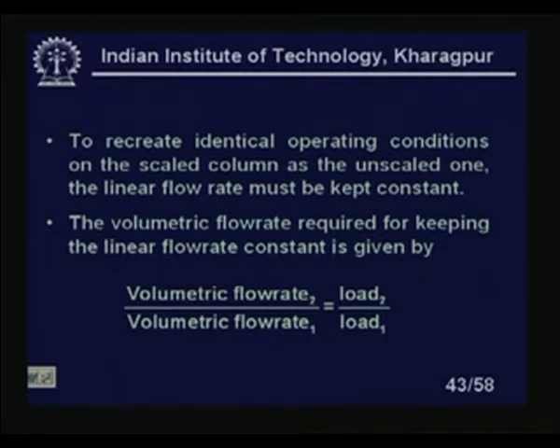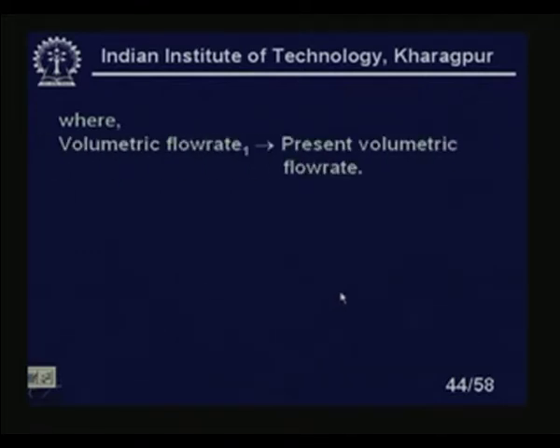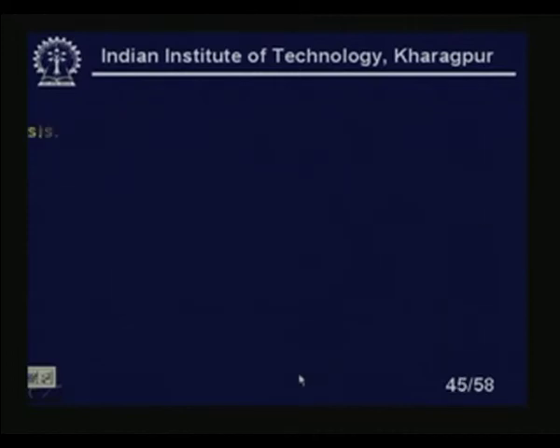Here volumetric flow rate 1 is the present volumetric flow rate, for the laboratory model, and volumetric flow rate 2 is the calculated volumetric flow rate.